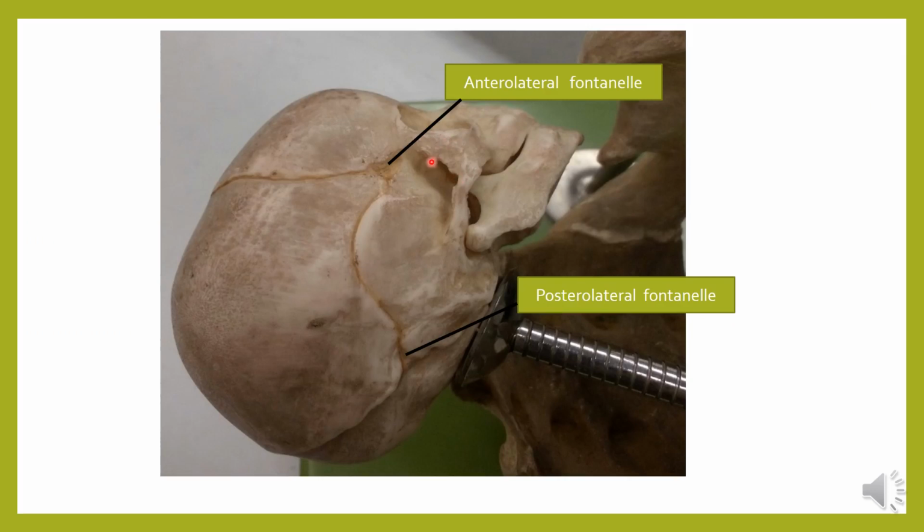And this is the anterolateral fontanelle, and this is the posterolateral fontanelle.